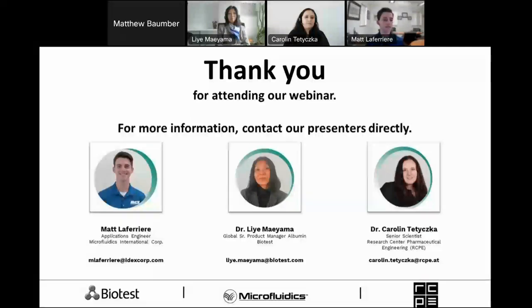Thank you. Is pre-saturation with solvent required for Biotest HSA? And if yes, why? Yes, we pre-saturated it. This was according to our literature review. We found that pre-saturation is more efficient if you pre-saturate it before, and we then decided to use only pre-saturated aqueous phase.